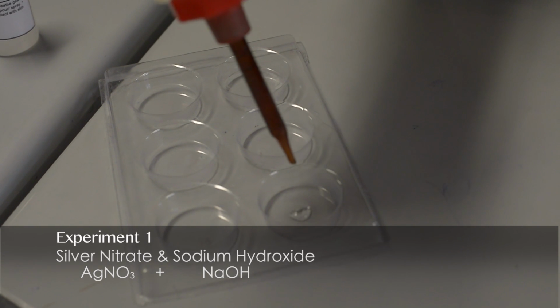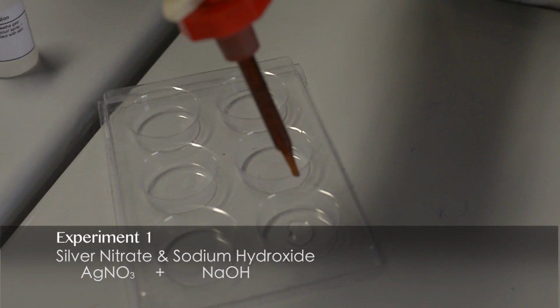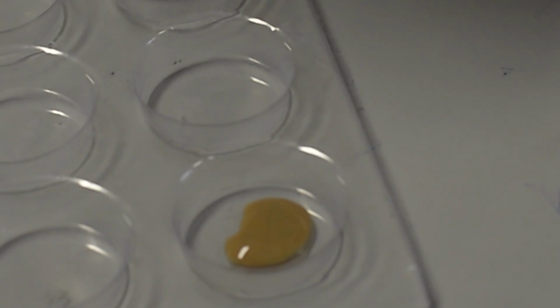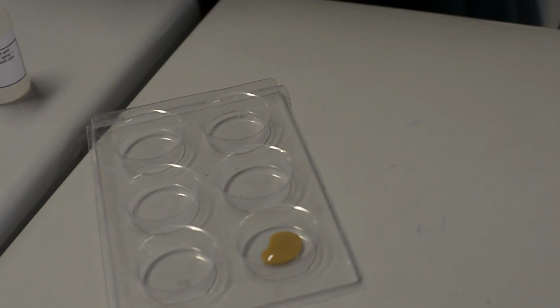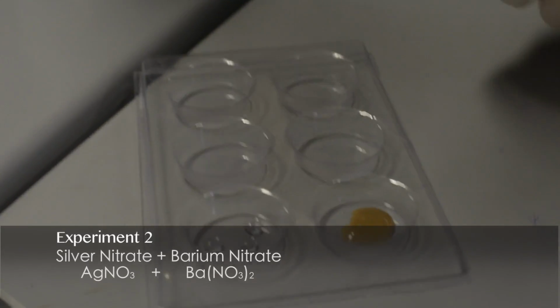Silver nitrate. I thought it was going to be blue. Look. You missed it. I was watching. So silver nitrate and sodium hydroxide, and you saw what? Chemical change. Colour change. Colour change permanently. It's not going backwards.